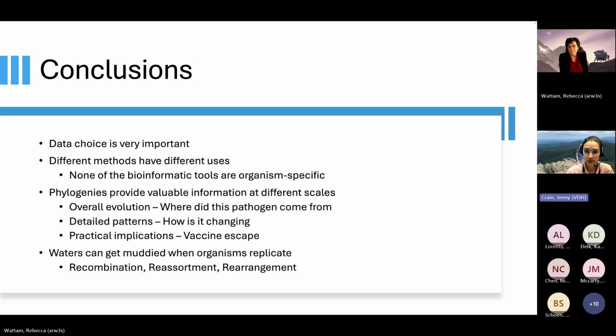Since our molecular subtyping is based primarily on the HA and NA gene segment of the virus, I wanted to understand, when you're doing multi-sequence alignments for this genomic comparison of the flu viral isolates, do we ever need to examine the other ones that you classified as three rapidly evolving gene segments? I would think maybe the PB1 and PB2, but you listed the polymerase binding protein 2 as a slower evolving one, but do we ever need to look at those in addition? And if we do that, do we just use those segments for creating additional phylogenetic trees?